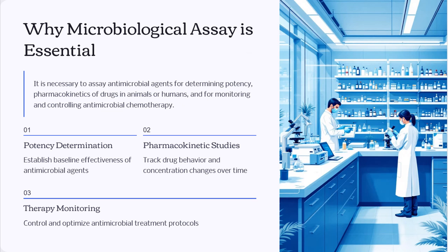So the needs of microbiological assays include, first, the determination of potency, that is, to establish a baseline effectiveness of antimicrobial agents. Second is pharmacokinetic studies, that is, to track drug behavior and concentration changes over time.